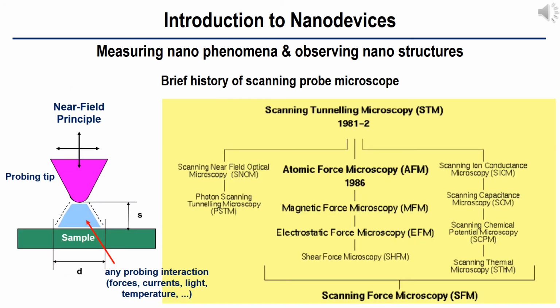Along with electron microscope, it is possible to use near-field generated by nanoscale tip. The microscope which uses the nanoscale tip for nanoscale imaging is scanning probe microscope. It has a great advantage different from optical or electron microscope, which is no diffraction limit. This is mainly due to the near-field generation around the probe.